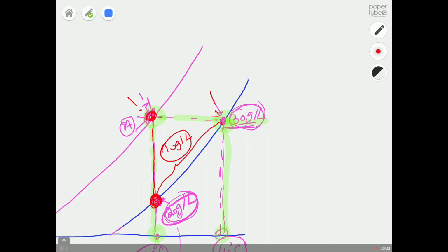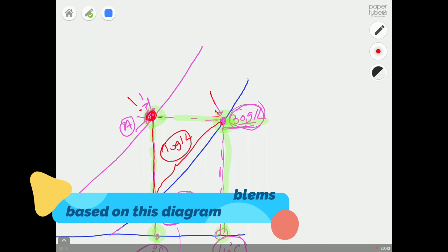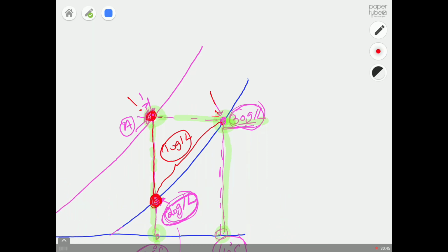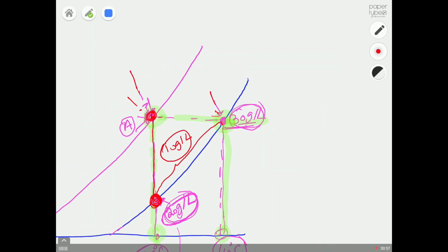And if you check the size of the crystals, we can check even using a normal microscope, and then we can even calculate the size fractions. If you see that, you will see a graph like this. And then another issue is we will never know how many crystals we formed at this point.